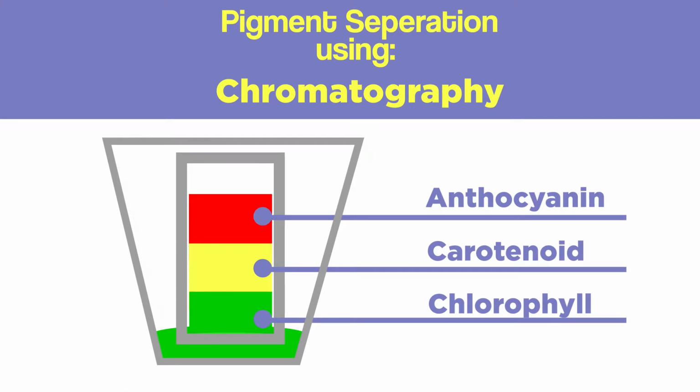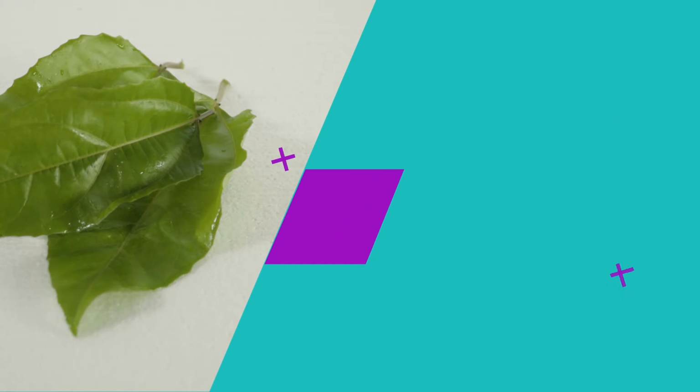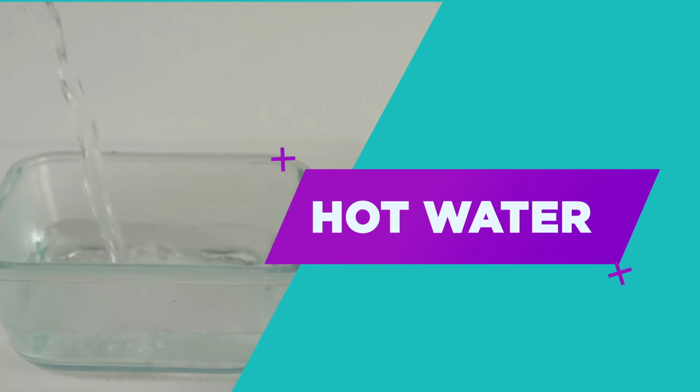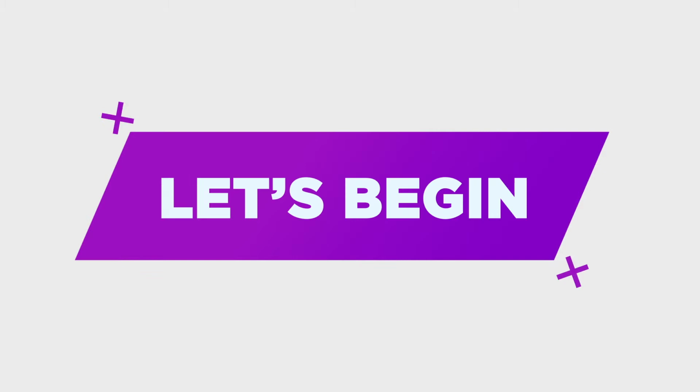To start the experiment, we will need a blender to grind the leaves. We will also need the leaves, of course, which we will extract the pigments from, and we will need alcohol to help with the separation of those pigments. We also will need hot water to speed up that process. All of this is necessary for this experiment, as we would love to see how chromatography works with biology. Let's begin.